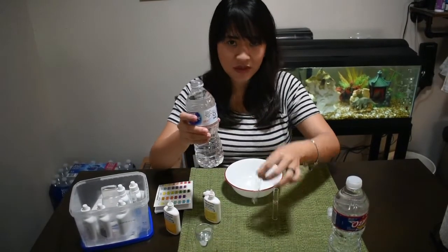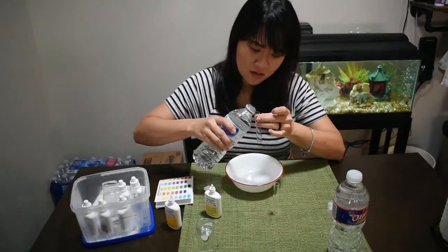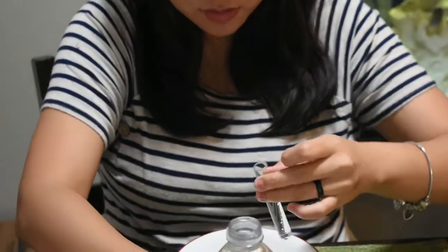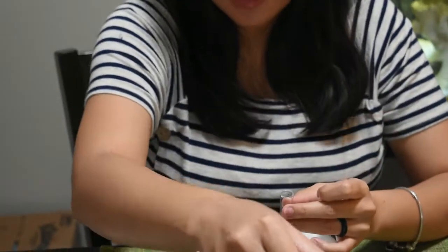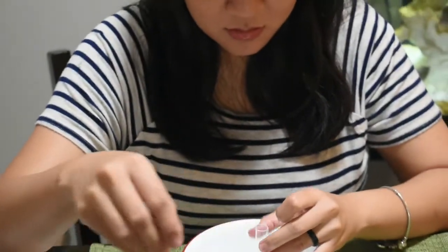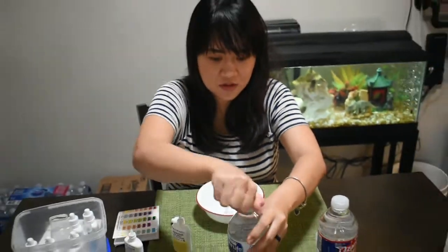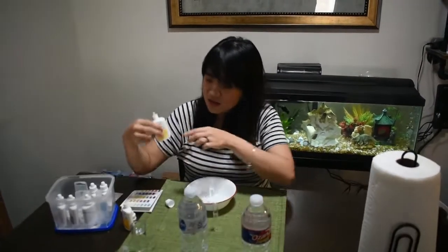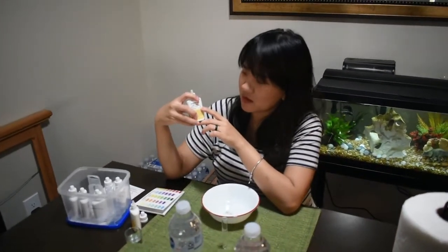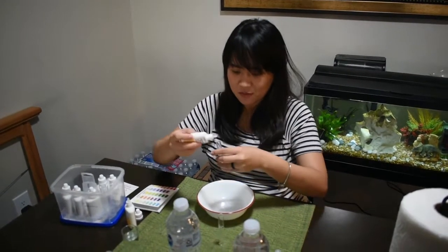I will pour this in the second bottle, and again it's same 5. Oh, too much. Yep, it's good. I will close this because I don't want to make mess. So we pour this again, bottle 1, same like before.